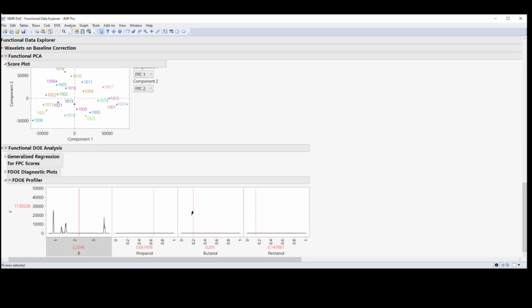Oh, Chris, we do have a question in the chat. How would you handle analyzing data where both the response and the covariate are functions of time? Where both an input and an output are a function of time. So what I would do there is you kind of have to off-road it at that point.